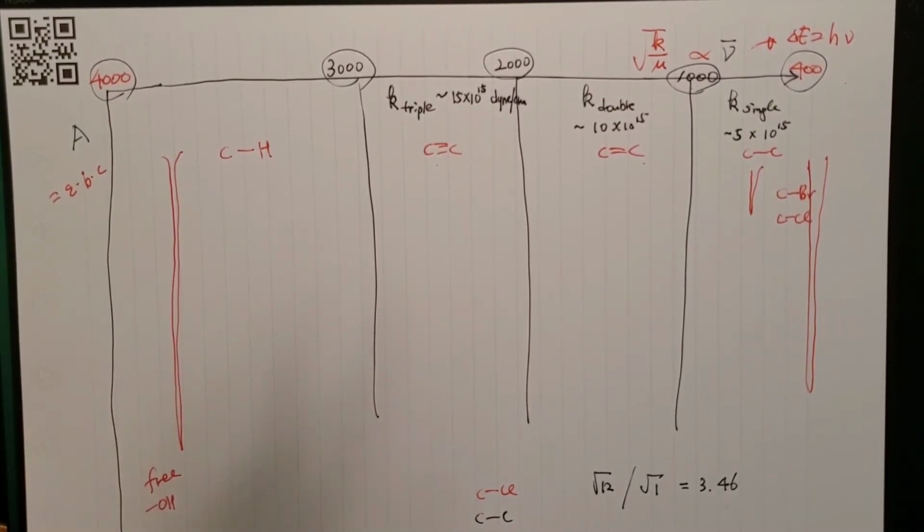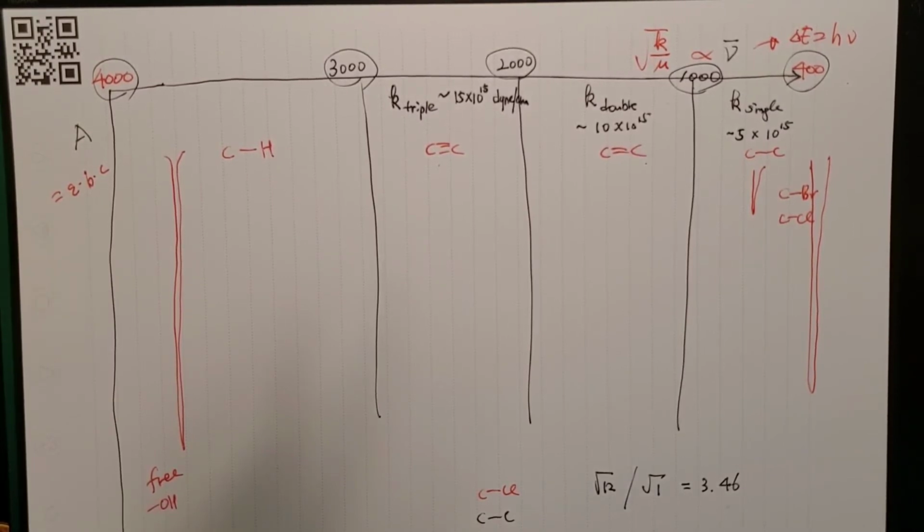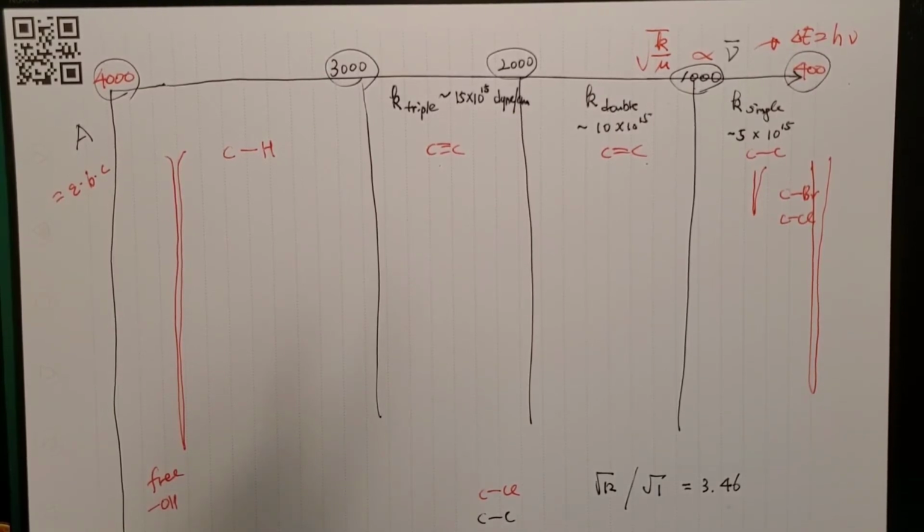Say you have a protein with an OH functional group residue embedded in the lipophilic bilipid layer of the cell, then you have no water or something, then it can be sharp.